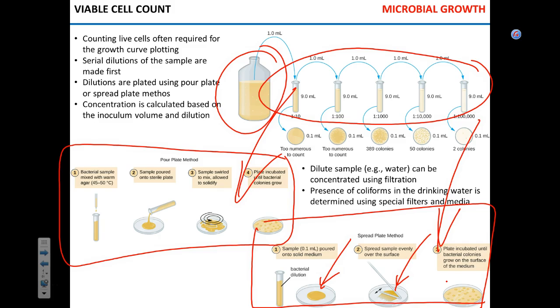You can actually do the replica plating on the agar and see what's growing. You can directly apply some special differential media that will highlight the bacteria, say coliform bacteria or lactose fermenting bacteria, and so on and so forth. But the idea is that you concentrate the bugs from the diluted sample using filtration. Does that make sense?